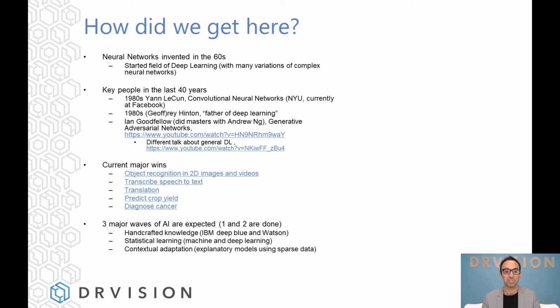there's been quite a lot of development. These are the key people that you will come across when you start to search. And there's several fields where you will find applications for deep learning. I have a few listed down there, but there's probably even more. And I'll put this presentation online so you can use those links that I have down there. Speech recognition is probably one that a lot of people would use also on their smartphones. If you use Siri or Cortana or anything like that, it is translating your speech into text and into actions sometimes. And that also uses deep learning.